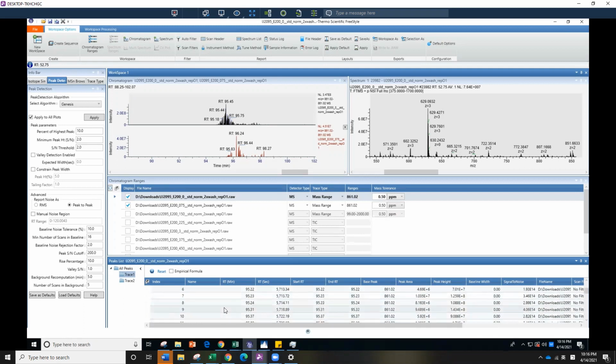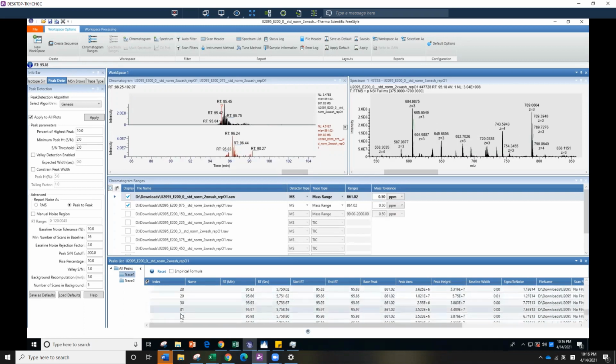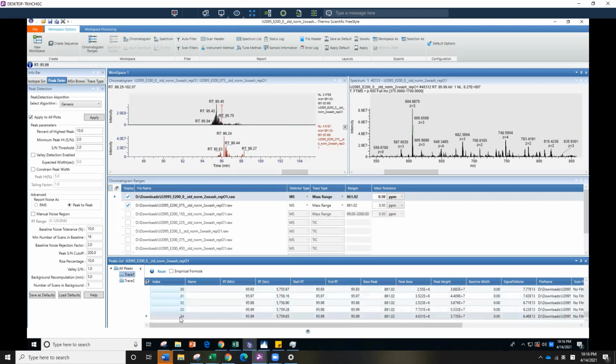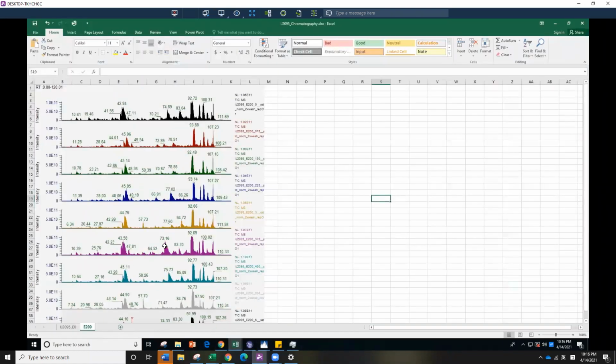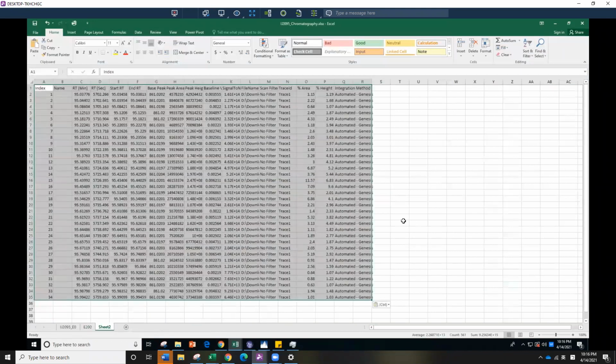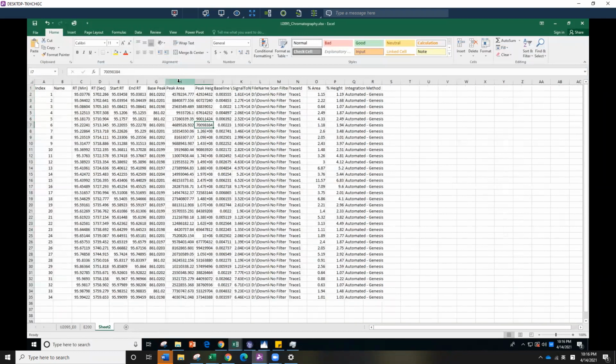So what you will do is copy all of it. I think you really just press Control C, copy, go to one of your Excel sheets, and paste it. It gives you the file, which is 0, and what you really care about is the peaks area here.